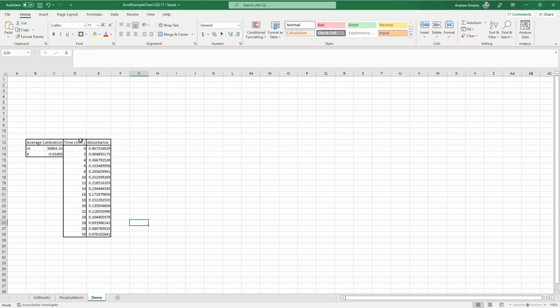These two columns right here, the one on the left is time. That's your x-axis. You should have measured every 2 minutes, so 0, 2, 4, so on and so forth, up until 30. If for whatever reason you did it a different way, where you measured twice a minute, so you would have 0, 0.5, 1, 1.5, 2 minutes, so on and so forth, you can still take that data and just copy and paste it into Excel, and then from there you could delete the 3 numbers in between 0 and 2 you don't need, and then the 3 in between 2 and 4, and then you could kind of scrunch your table up to look like this using various copy and pastings.